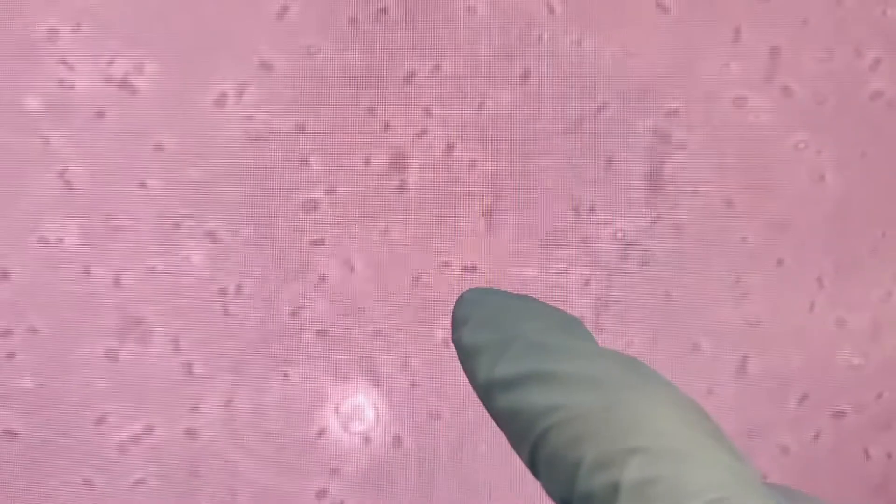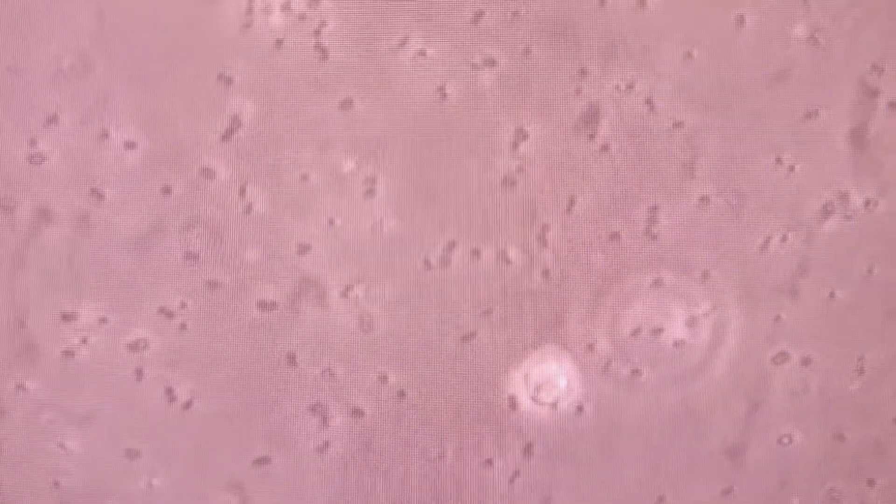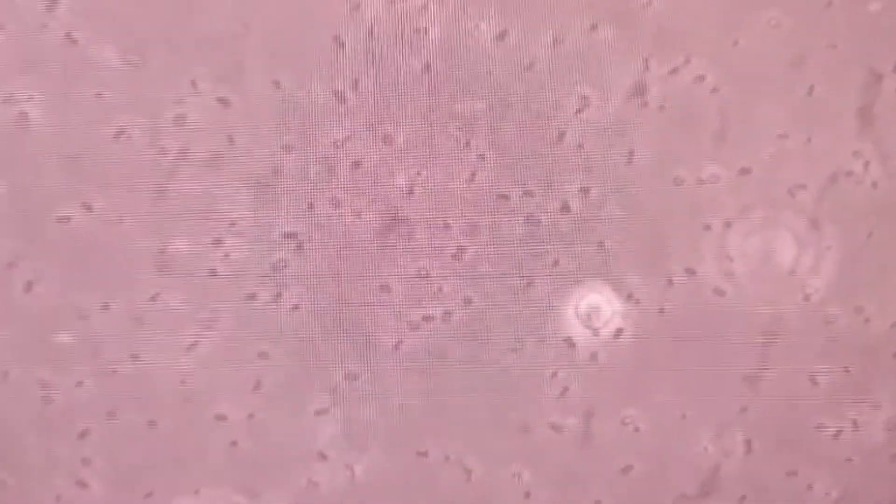For example, it's very difficult to focus because they are really tiny, tiny. Look, these are two joints. This one, this little guy will divide soon. Because they are having their cell division. They are basically two. One bacteria snipped in half. Going to snip into half. And make two bacteria. So, one bacterium to two bacteria. And they are all taking the food which I was giving to the cells.